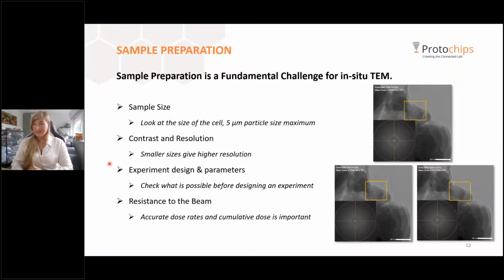But next to this, you're doing in situ in an electron microscope. It might be good to think about that you want to have things that you actually can observe. We, for instance, have had people ask us before that didn't have that much experience yet, can we observe hydrogen gas interacting with our nanoparticles? Yes, this is possible, if your nanoparticles are undergoing some type of reaction, for instance, they're changing in phase, they're changing in shape or size, or they're walking around doing sintering.